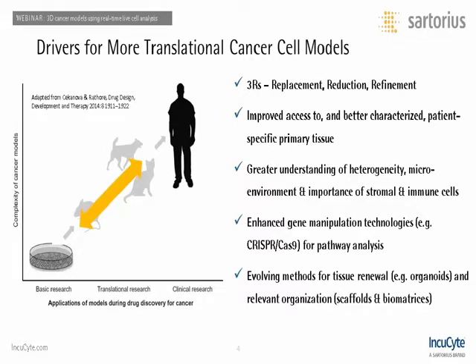I think you would agree there's an ever-increasing drive to improve the rate of success of anti-cancer treatments transitioning to the clinic. An accepted, or very much acknowledged, way to achieve this is to more closely align in vitro cellular models with each stage of preclinical, animal and patient models. The example on the right-hand side of this graph describes some ways to achieve that.